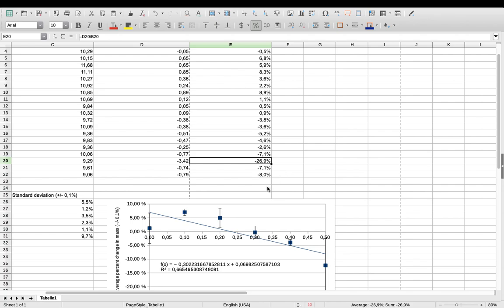outliers are oftentimes the most interesting data points. Sometimes something different happened here for some reason, and this measurement is showing you that this was some different effect. Now, it could have been a mistake. It could have been that you've forgotten to tare the scale, or you included the mass of the beaker or the paper towel or something else like that. Maybe a piece of potato tissue went missing or something like that. This looks like this mass change could have been due to a missing piece of potato tissue, for example. It's hard to say, since I didn't take these measurements, what happened here.